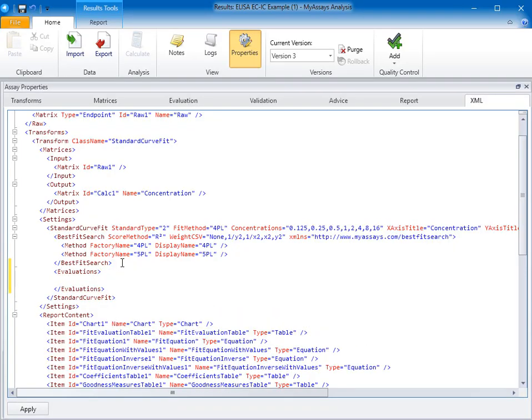The C parameter is the value on the x-axis of the midpoint of the curve. So for this evaluation, I'll use the type calc_y. This will evaluate the value on the y-axis at the midpoint of the curve. If you're interested in reporting the value of the C parameter on the x-axis, you could simply use an evaluations table reporting the C parameter. For more information about evaluations tables, please see the associated video.